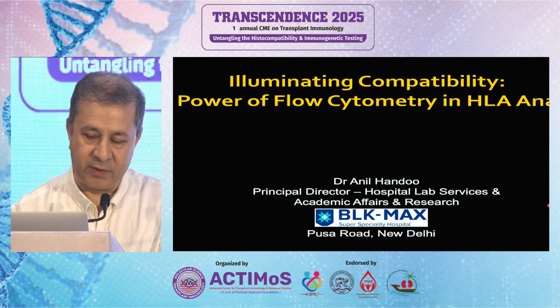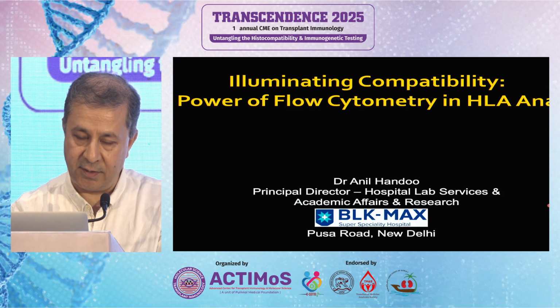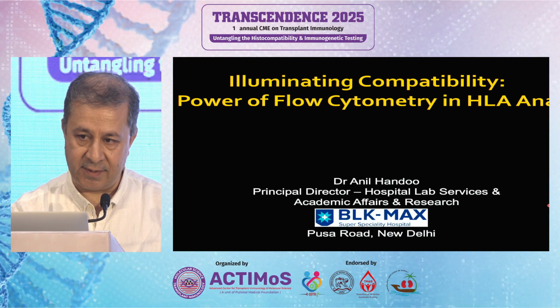So I'll be talking about flow cytometry today, in the context of HLA typing and HLA analysis, and primarily what we're discussing is the HLA antibody assays.